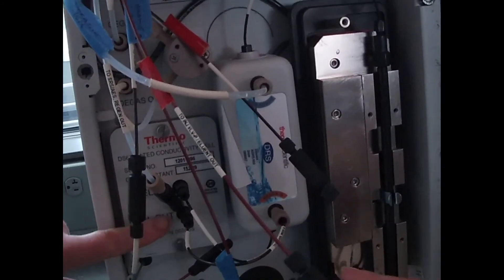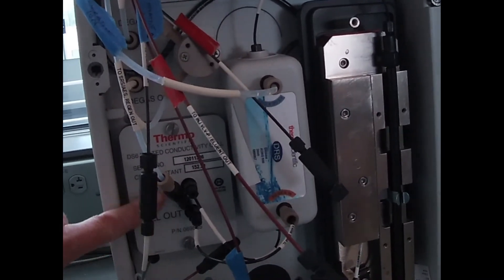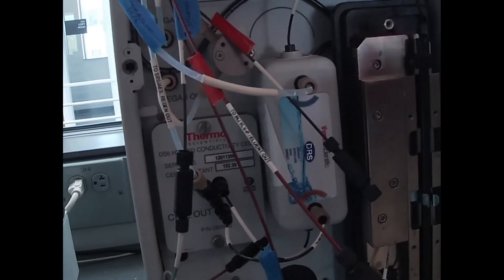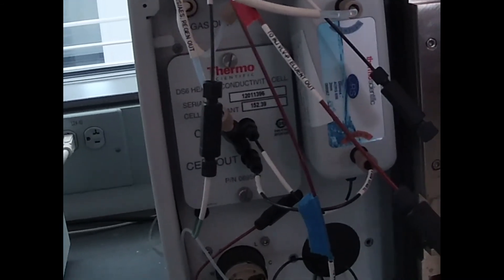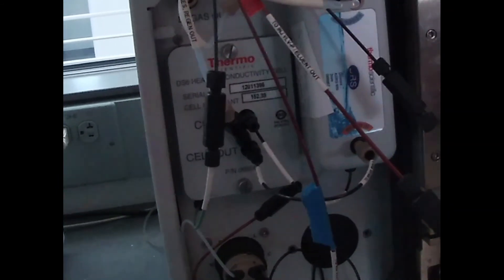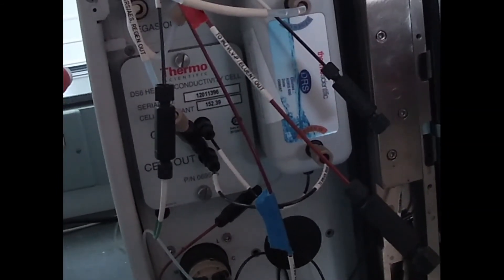So we pass through here and then we actually go into our conductivity cell. The conductivity cell is a flow-through cell, and so we detect the conductivity which is reflective of the number of ions that are in solution. The more ions, the higher the concentration, the higher the current. Therefore, you're going to get a larger signal.